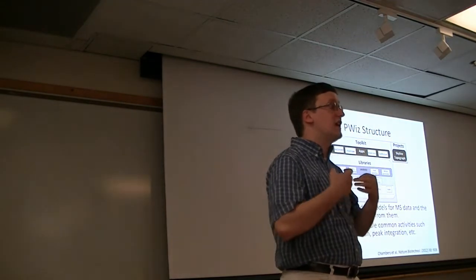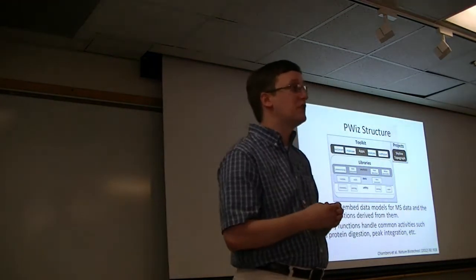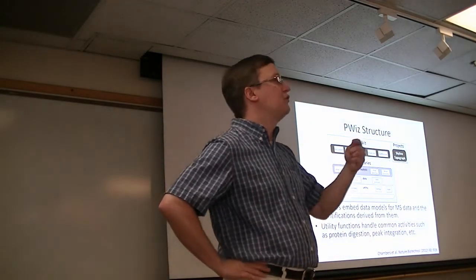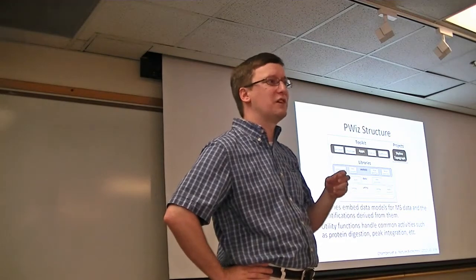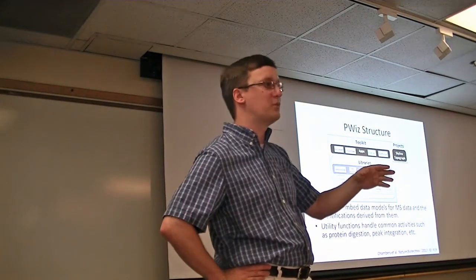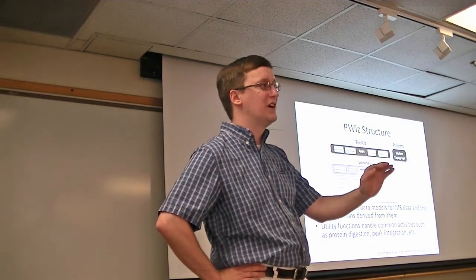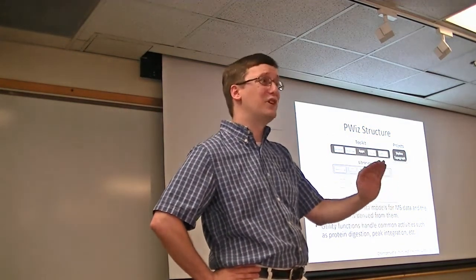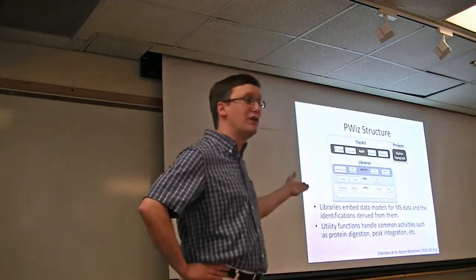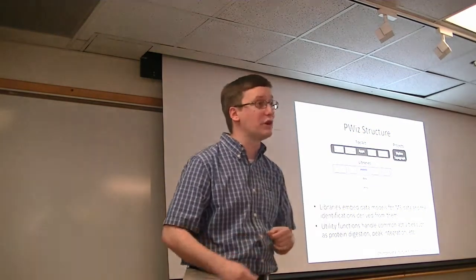The goal here is that we want to reduce the amount of rewriting that we do within the proteomics field. Every person who writes a protein digester does so in a very slightly different way, and they may include some features well and some features poorly. We would really rather that we have a high-quality protein digester that everybody calls, because then we have known performance for how that code should behave. So avoiding the rewrite phenomenon is one of the key drivers behind ProteoWizard.